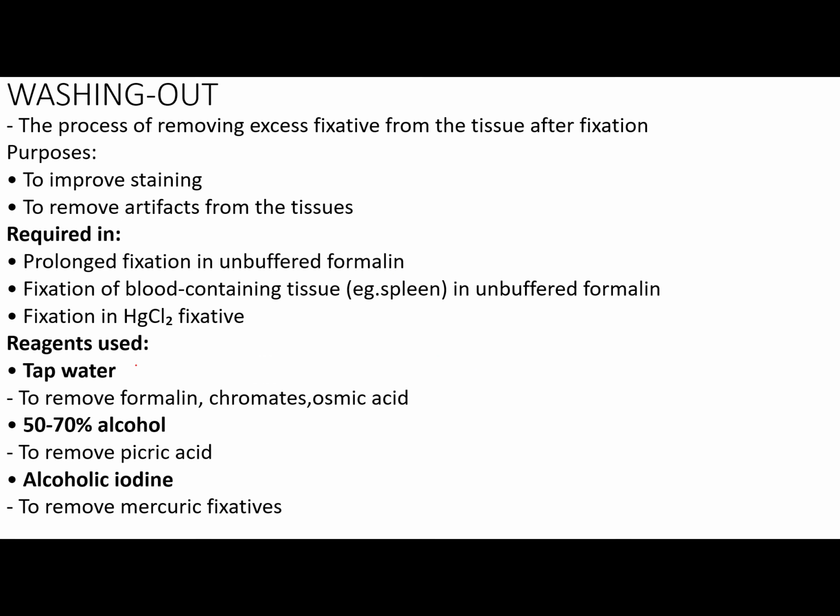Now, what are the reagents used? Merong tap water. Tap water is used to remove formalin, chromates, and osmic acid. 50 to 70% alcohol to remove picric acid, and alcoholic iodine to remove mercuric fixatives.